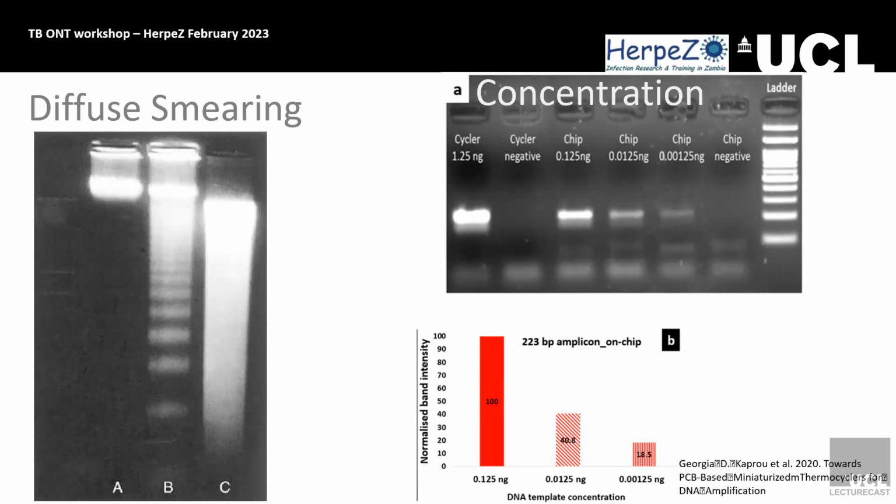You could potentially do a bead wash to get rid of those small bits, but for that amount of effort, you're probably better to just redo the extraction. Exactly, because with the bead wash, you tend to lose some DNA, so you might just want to re-extract.